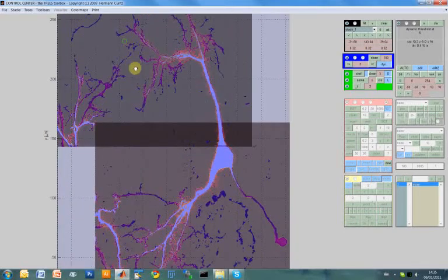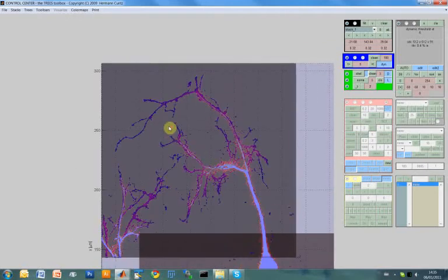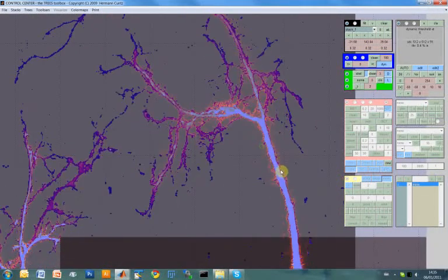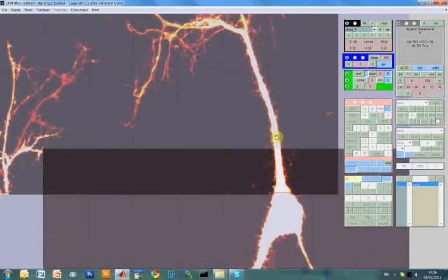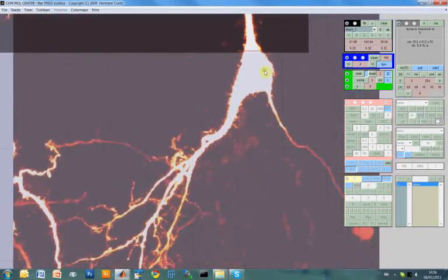And we see that it did a pretty good job. The user interface actually added some blue tiles onto the parts of the image which belong to the thresholded area, and we see that it did a pretty good job.